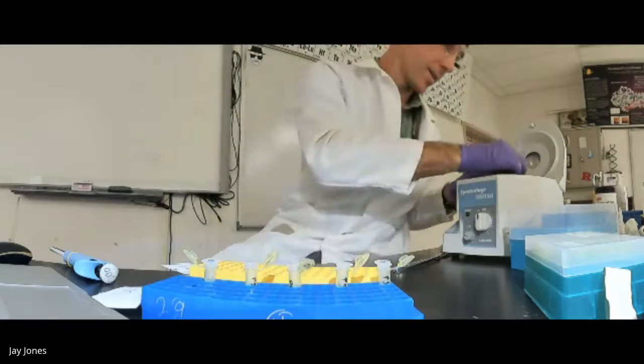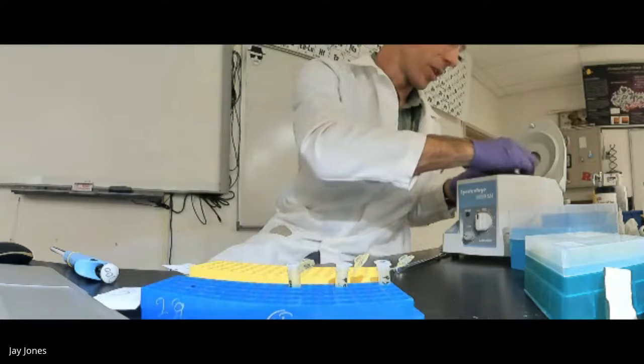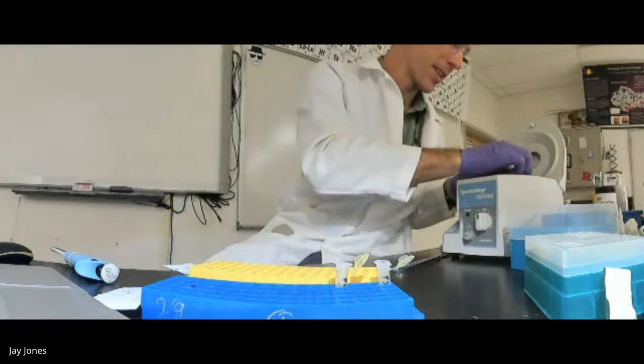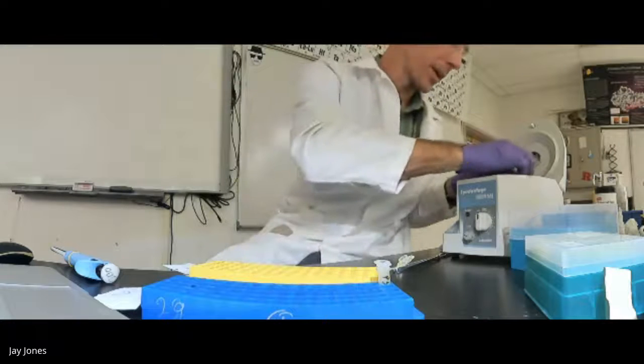This is some spin because only one cap is on. I'll show you in a minute. Only one cap is on, so the inner caps are just flailing about. And we're gonna spin these at 14,000 RPMs.